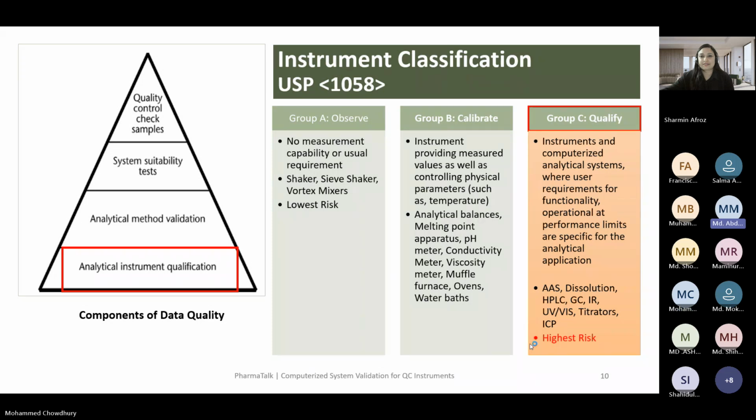Let's say we purchase this software from Germany, and we share our PC through online, and they install the software and use the certification key. That key is actually purchased from our site, and they install the software into our facility. If the vendor can provide you the software validations from their part, you can rely on their documents.